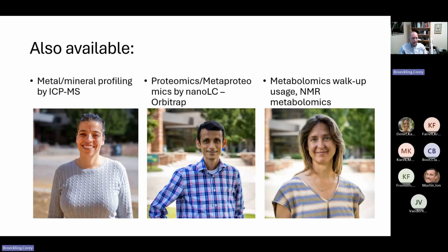I also just wanted to highlight some of the other areas of the lab. Jackie Chaparro on the left provides analysis of metals and minerals. So she's going to be providing a seminar, I think next semester, on application of this for food analysis, looking at metals and minerals in foods. Gustavo Diaz here in the center runs our proteomics and metaproteomics using our Orbitrap platform.